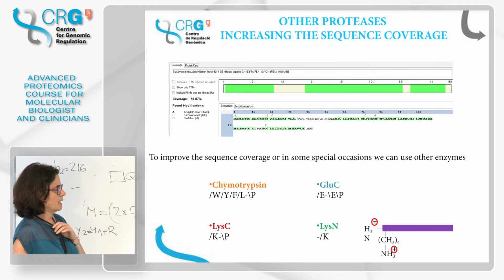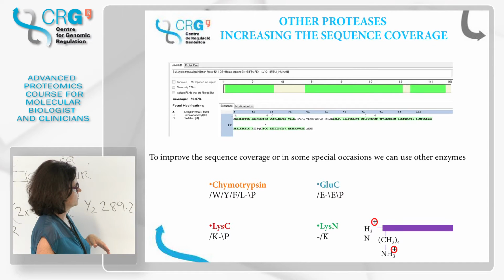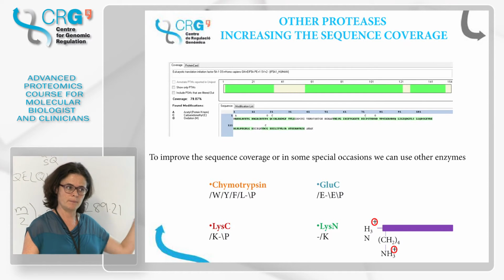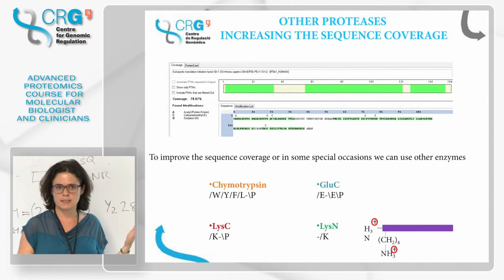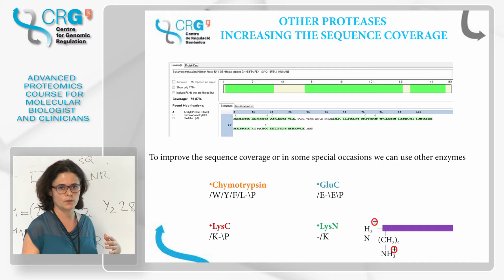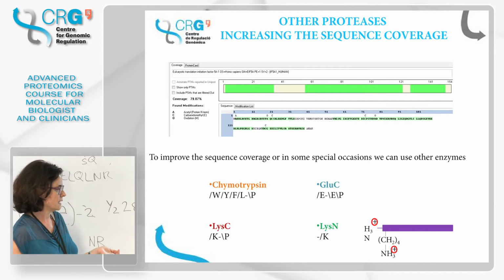But sometimes we don't want to use trypsin, because imagine that you use trypsin and you get this coverage, which is 80% coverage, which is very good. Coverage means what percentage of the protein you are seeing. We never see 100% of the protein; we see a percentage. 80% is super high. But maybe you're interested in a particular residue in here, which you know is phosphorylated, and with trypsin, you get this. So what can you do? You can try other enzymes.